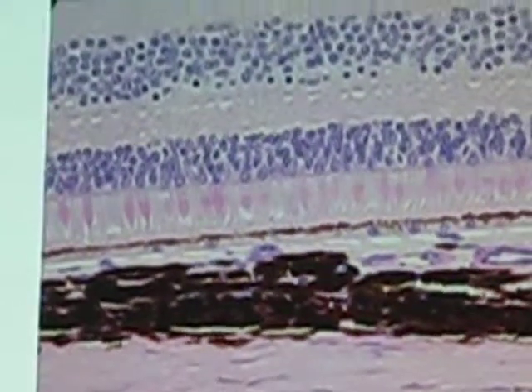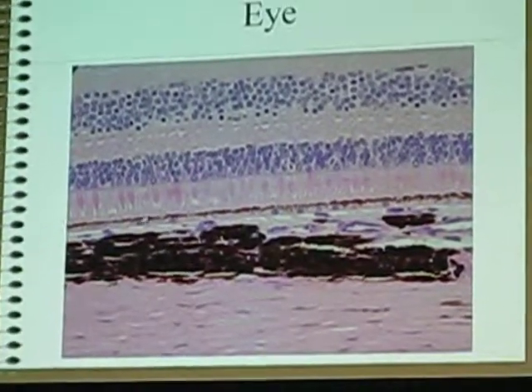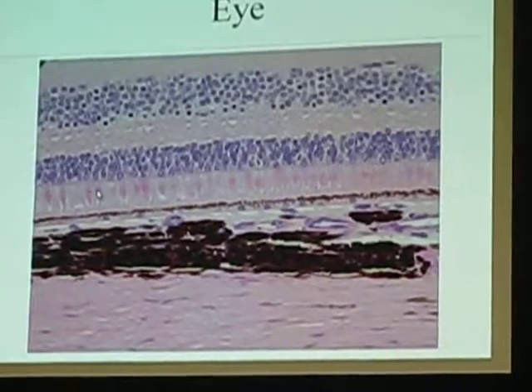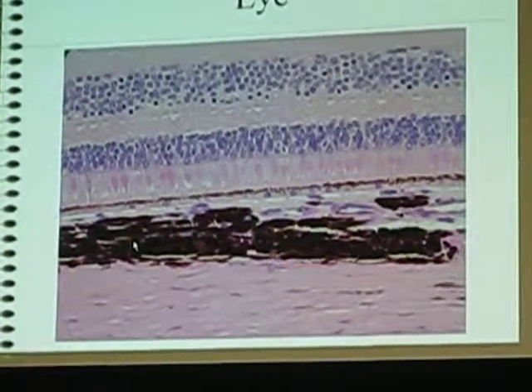And you do need to be able to tell the difference. So the cones are the dark pink? They're darker pink and they're kind of cup or goblet shaped. Rods are straight up and down and they're very pale. So this is a rod right here, and on either side of it, these are cones. And you can tell the difference. You really can.